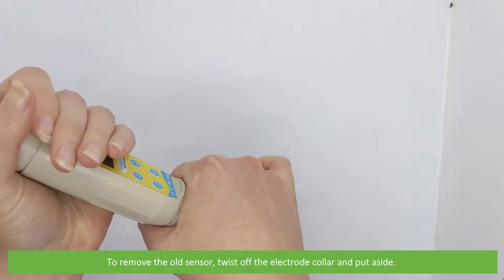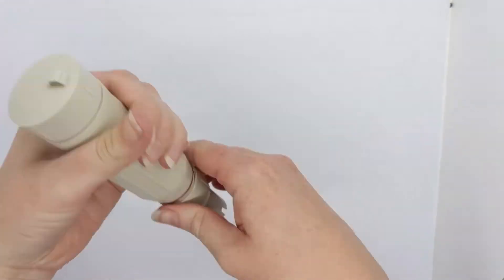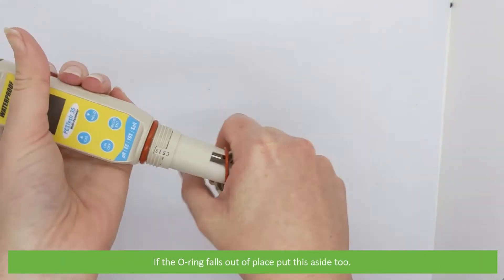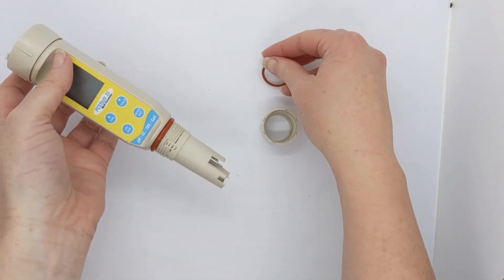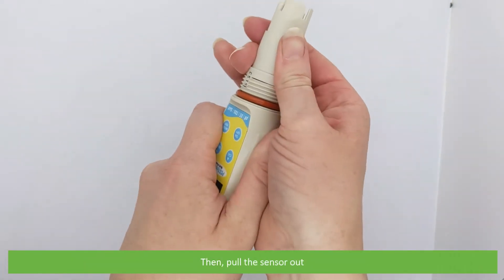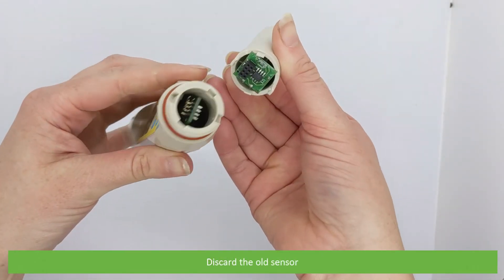To remove the old sensor, twist off the electrode collar and put it aside. If the o-ring falls out of place, that's okay — put this aside too. Then pull the sensor out and discard the old sensor.